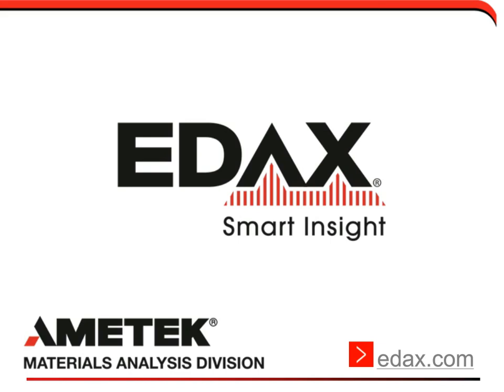Why 48 kV for the acquisition conditions? 48 kV is just a number that I've got into a habit of using, but basically the main requirement would just be to use a kV that's high enough to excite even the highest elements that you would potentially be interested in, which I'm assuming would probably be strontium or zirconium.